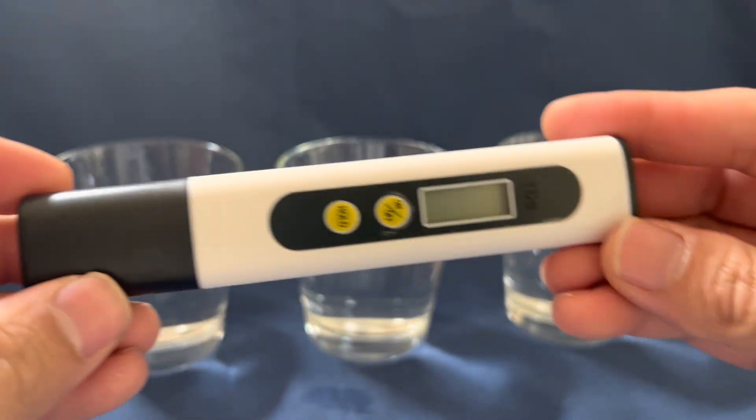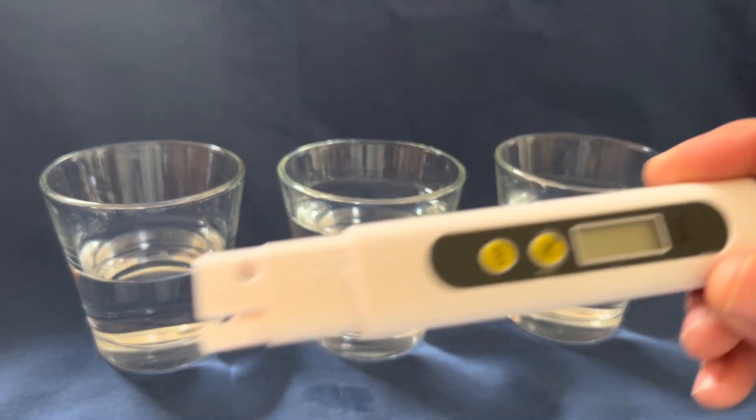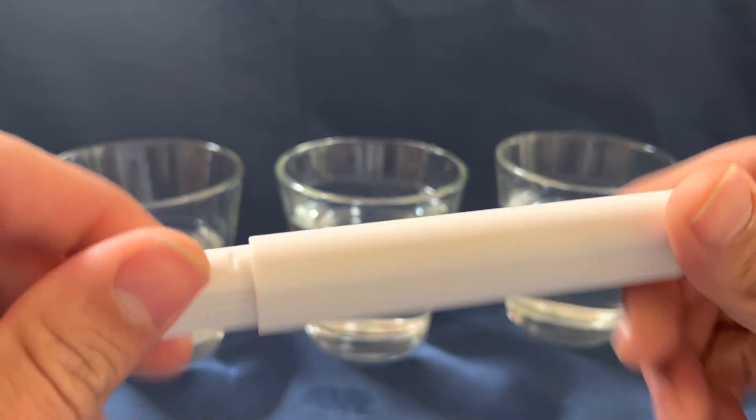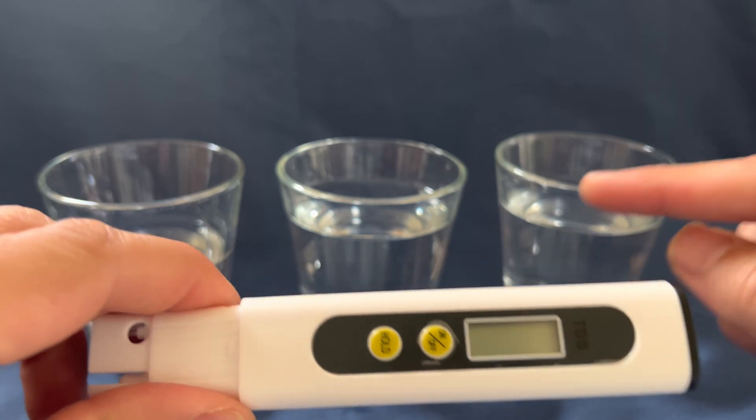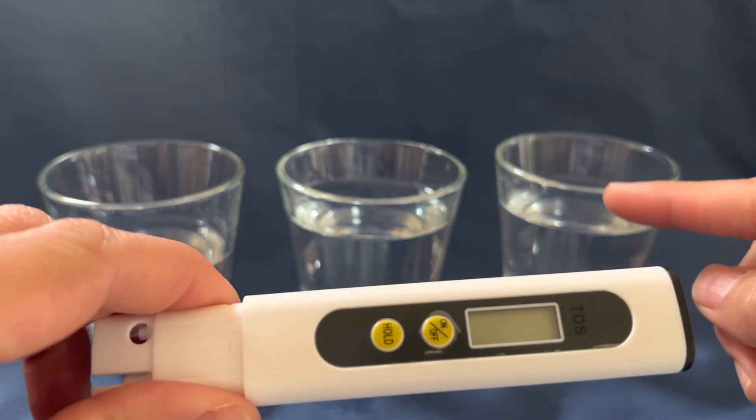This is what it looks like. Take the cap off. I have three samples of water here — one's bottled water, one's my reverse osmosis, and one's my tap water.